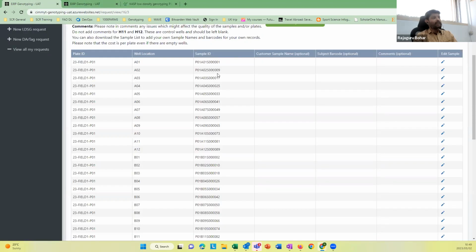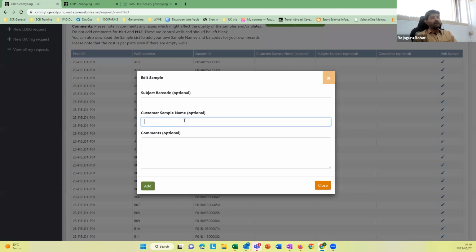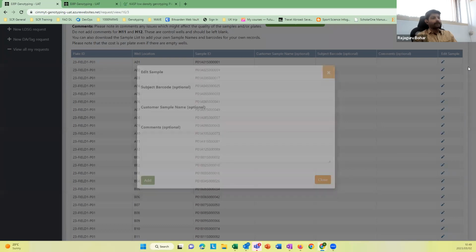Right now, if you see here, there is already a unique ID generated as the sample ID. So if you want to have your own sample name or additional unique ID, you can add that in the customer sample name, which is completely optional. I hope this answered your question, Vijay.